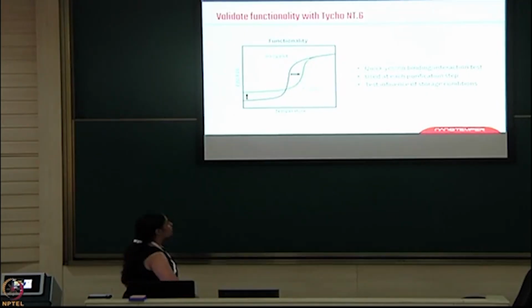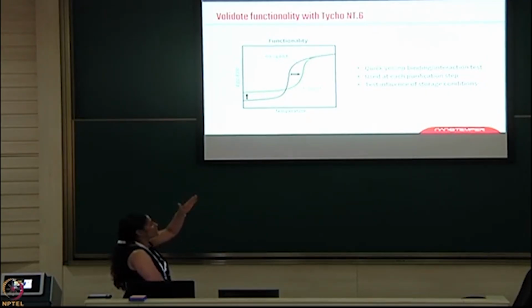Now, here you can also check the thermal shift assay. If a protein is there and you want to check whether the protein can bind with a particular ligand or not, you run the protein without the ligand and you will see a particular profile, and then in the presence of a ligand, the shift will change. The shift can be either a positive shift or a negative shift.